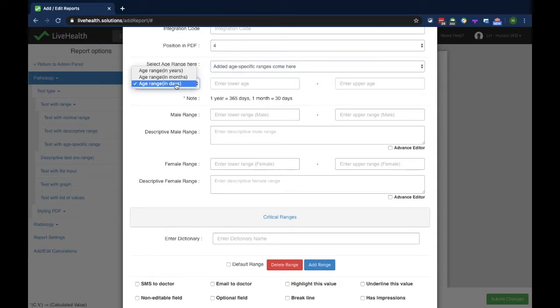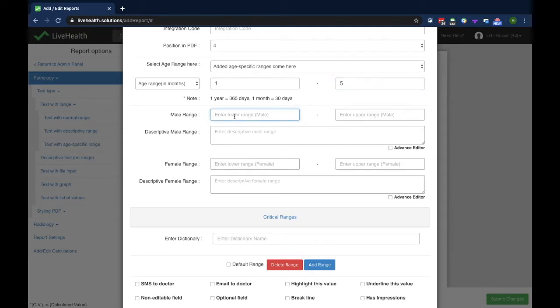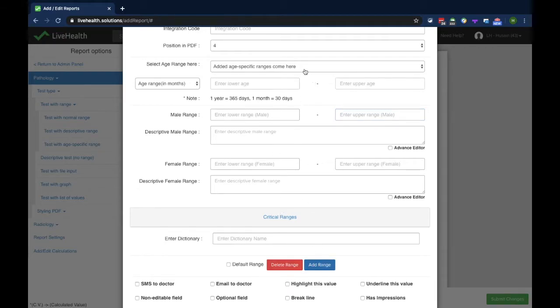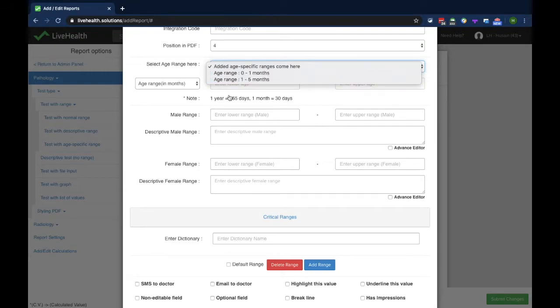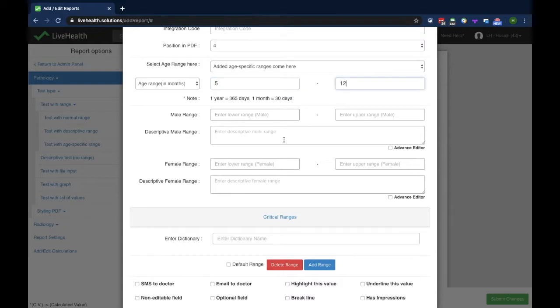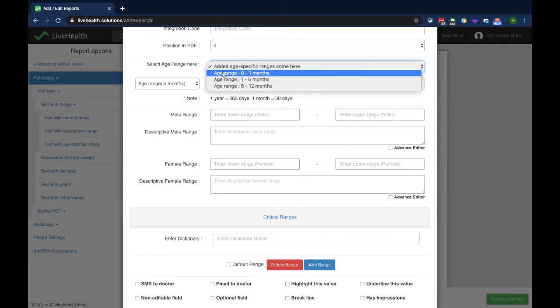Next I'll add a range in months: 1 month to 5 months with a range of 3 to 5. I click add range. Then I add 5 months to 12 months with a range of 3 to 7 and click add range. Now all three ranges have been added and are visible in the dropdown.